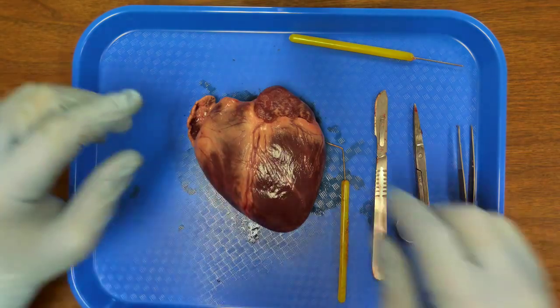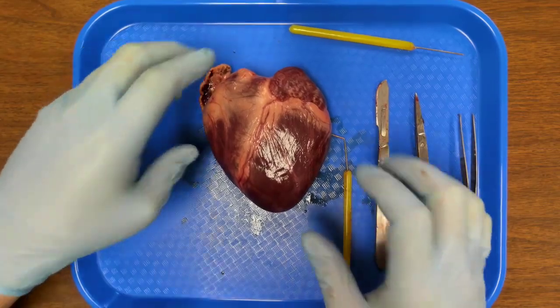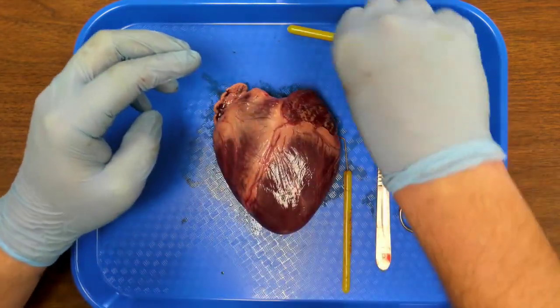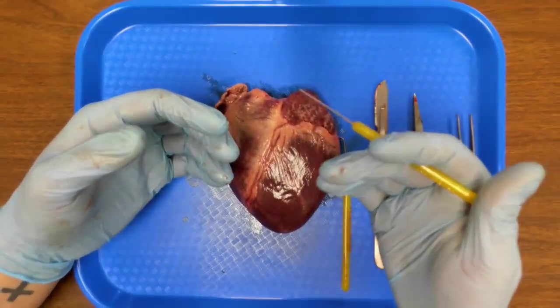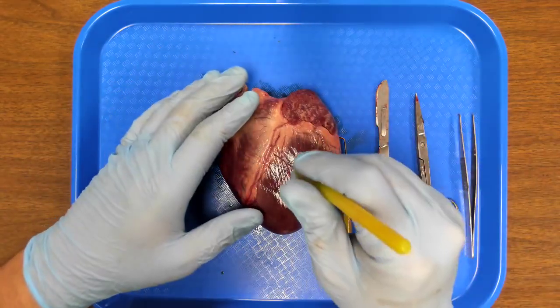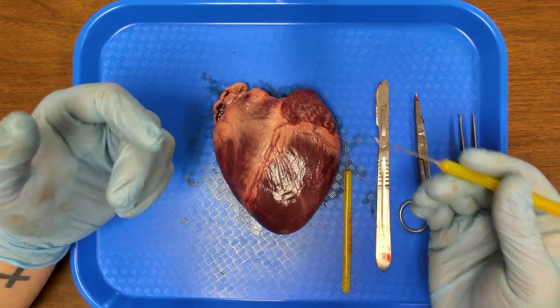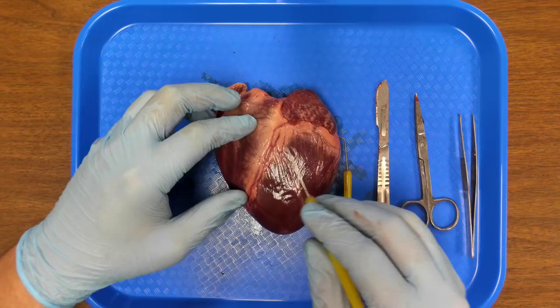Now, what I'm going to do is I'm going to take a cut. I'm going to cut right down those two halves, right down what we call the coronary artery, because the heart, although its job is to pump blood, which takes nutrients and oxygen to every cell in our body, is also a muscle. It is also part of the body, and because of that, it needs blood as well. It needs to feed its tissues as well.